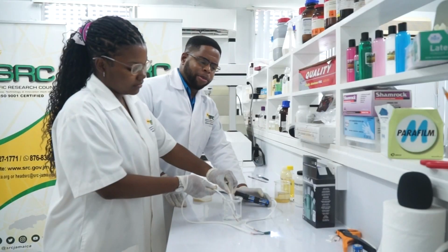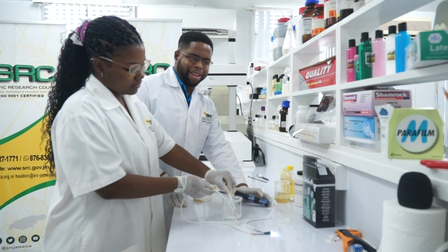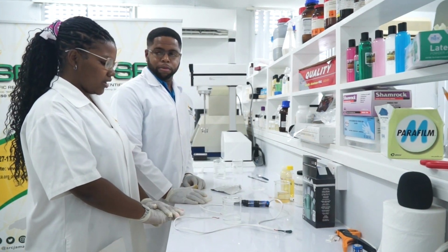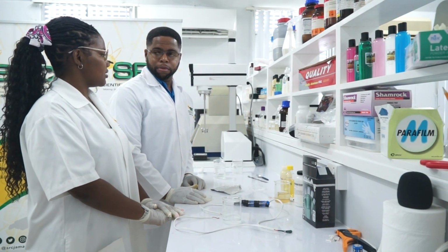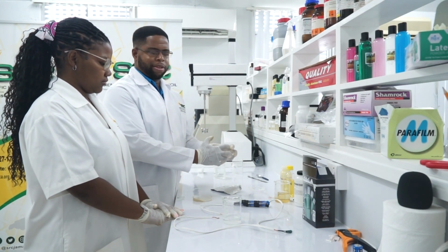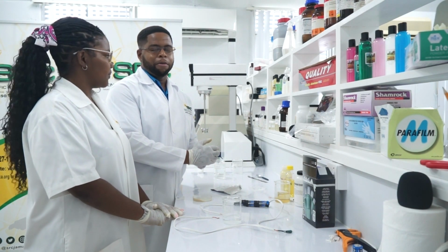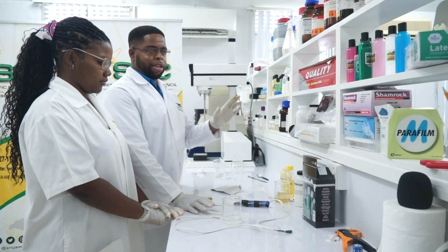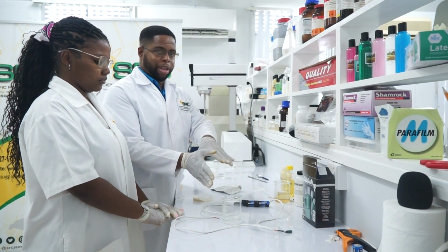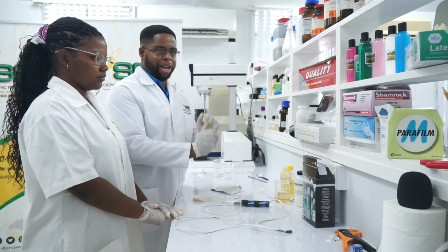Essence, do you have any hypotheses or any theories as to why salt is able to conduct electricity in water? The solution has ions, and ions are charged particles. And why was it able to do it in water when in a solid state it is not able to conduct electricity? Well, in the water it can move freely. Right, and recall we said earlier that electricity is the flow of charged particles. So in a solid state, the particles cannot move. But once you put it in a liquid or an aqueous solution, they're able to move, able to flow, and thus able to carry an electric current.